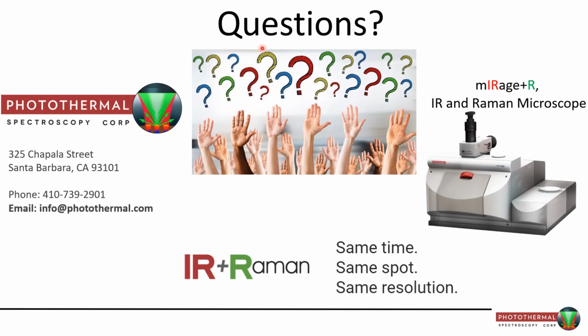And maybe this should be the last question as we're nearing the end. This one is probably for you as well, Andy. How similar are the O-PTIR spectra to the ATR spectra? So yeah, we've done some comparisons with not just some of these standard inorganic salts like ammonium sulfate, which turned out to be quite comparable. But we've also started looking at some more complicated molecules. We use organosulfates a lot in our work, and we've done some pretty detailed analysis. And frankly, the modes have all lined up pretty well, which we were excited about.